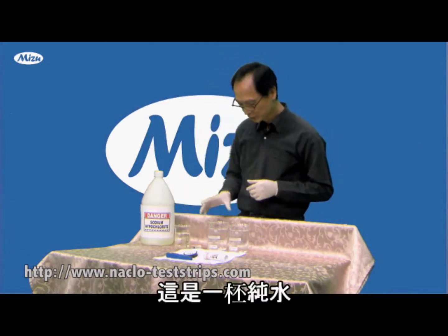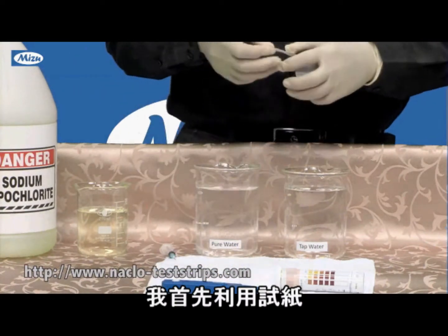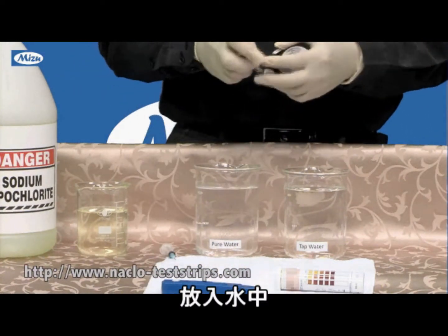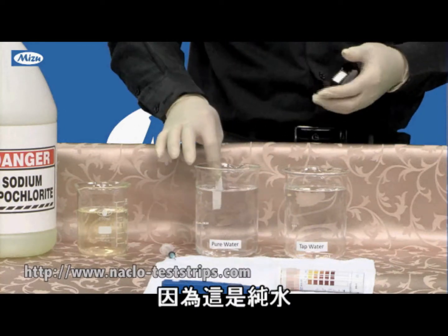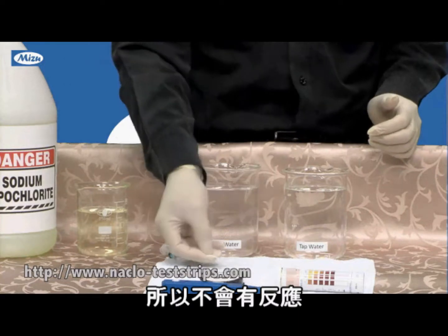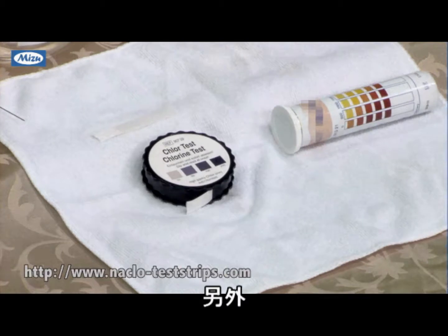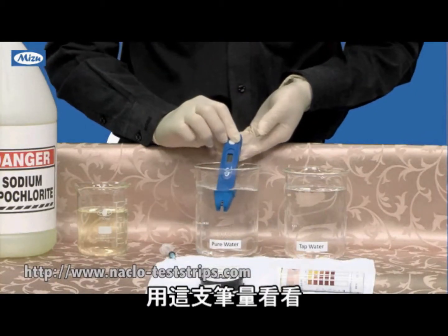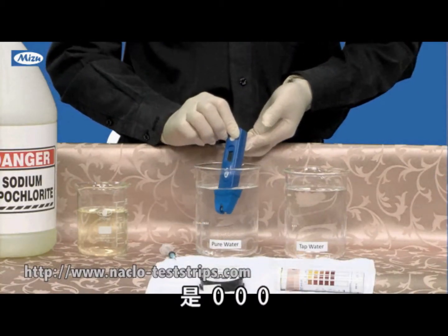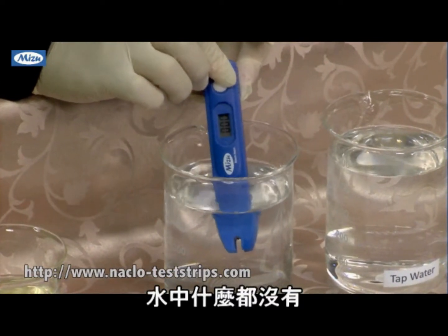So this is pure water. I take the test strip in this water, and because this is pure water, the strip shows white color — nothing in the water. The same thing: this pen here reads zero. Nothing in the water.